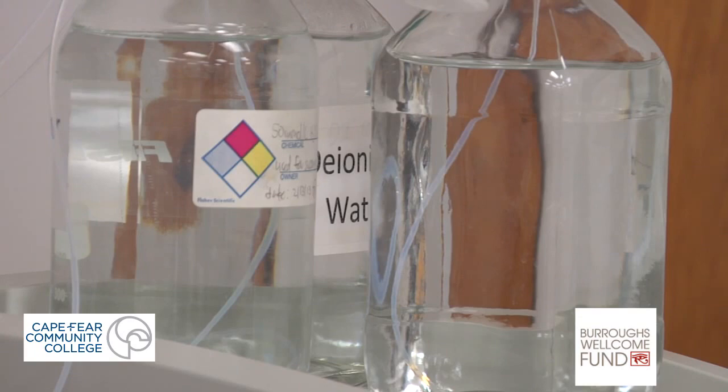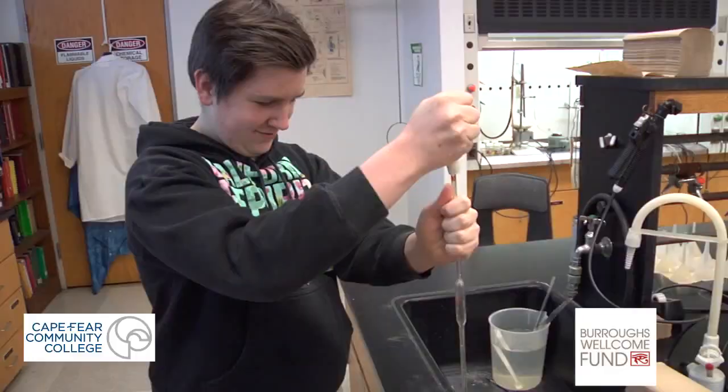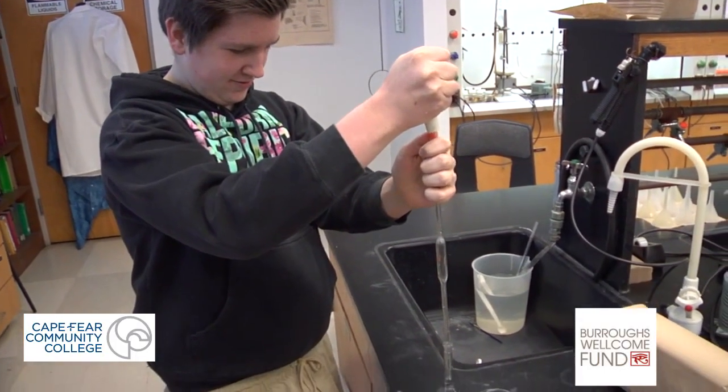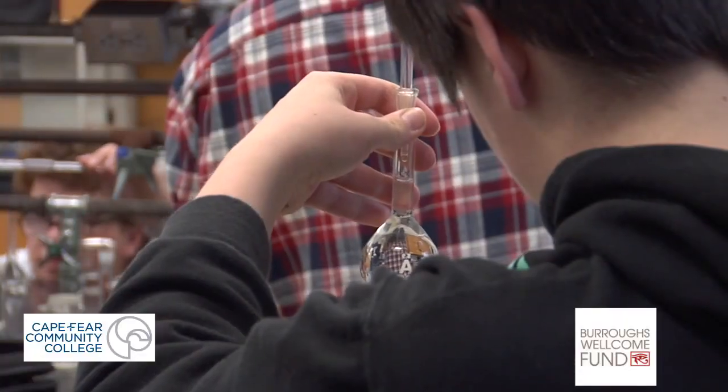And the reason you have to do this is because we're trying to figure out which ones are bad and which ones are good. With magnesium, some people can have seizures and they need magnesium. I'm guessing we'll find a slight deviation between the Deer Park and Smart Water, but large deviations between the sink water and Smart Water, yeah.